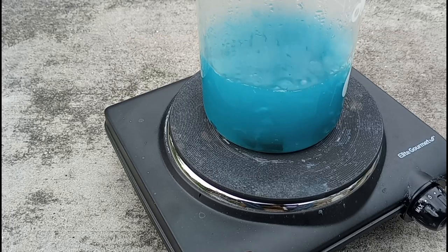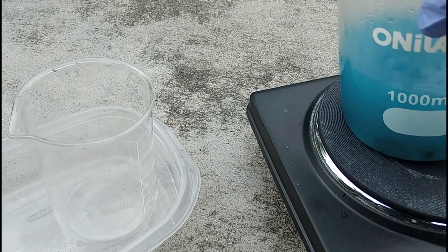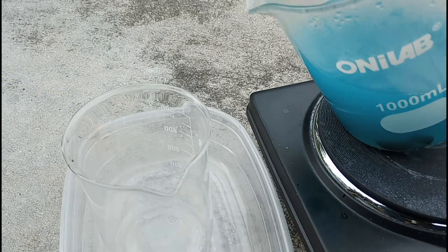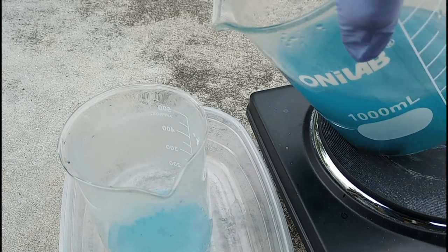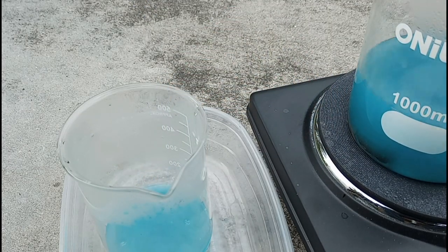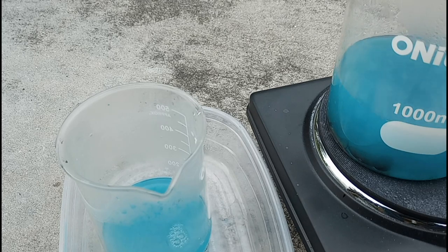I increased the temperature and brought it up to a rolling boil to try to reduce the solution. Now that it's about where I want it, I'm going to pour this liquid into the other beaker to get all of the precipitate. I'm going to temper the glass by pouring in a little bit at a time to prevent thermal shock from cracking the beaker.